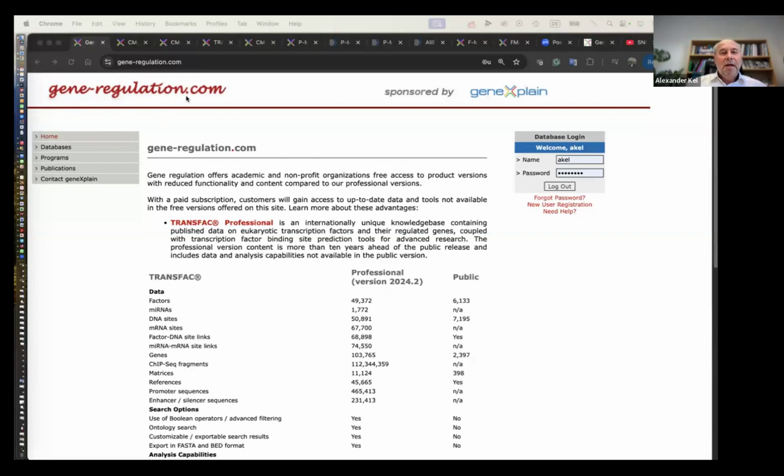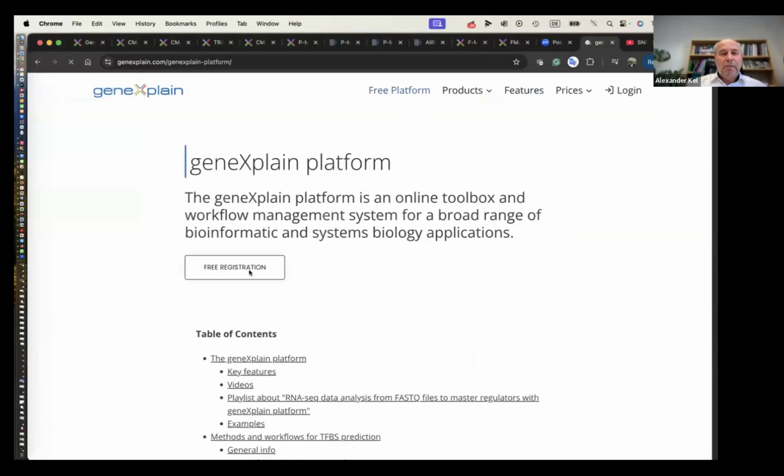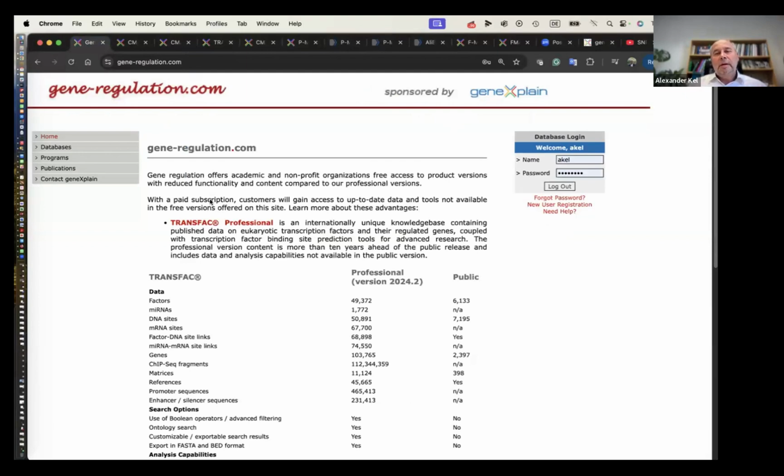It's a free TRANSFAC website where you can register and do your analysis. We also will look at another free tool, which is called the free GeneXplain platform, which you can register at this website. And we'll talk about the difference and what you can do with generegulation.com to study your promoters. But before, let me just start right away and do the first search, and then we'll talk about what we're actually doing.